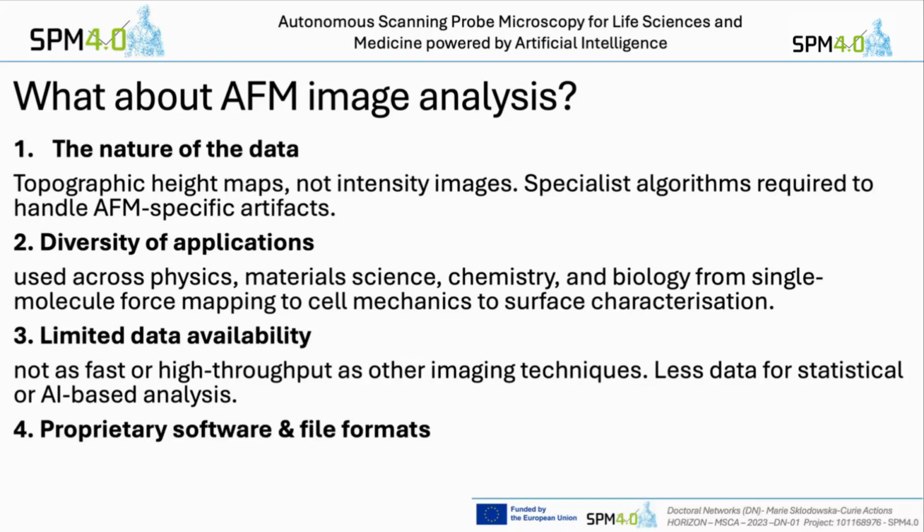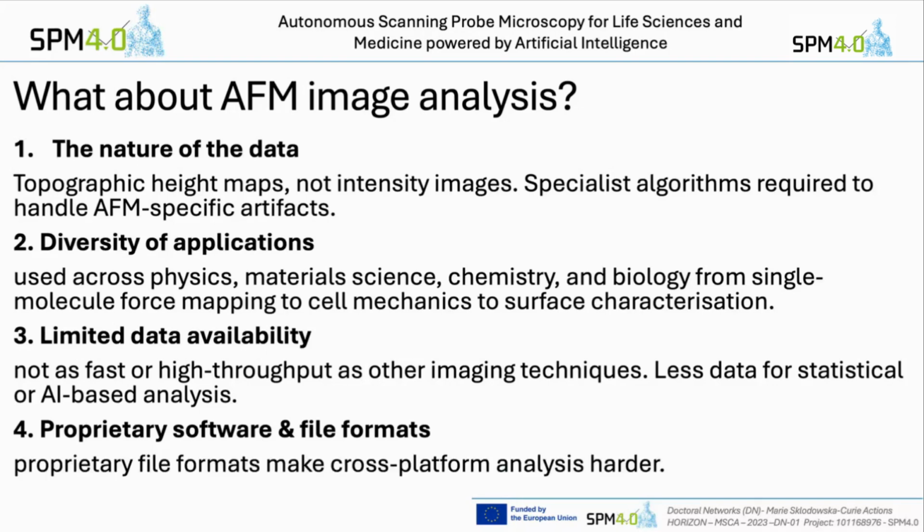And the big thing, and the AFM community in general is getting better at this, but historically it's been very bad for proprietary file formats from various companies, making analysis between different software very difficult. It is getting better now. People are generally adopting the SPM image format, but yeah, it used to be quite bad for that.